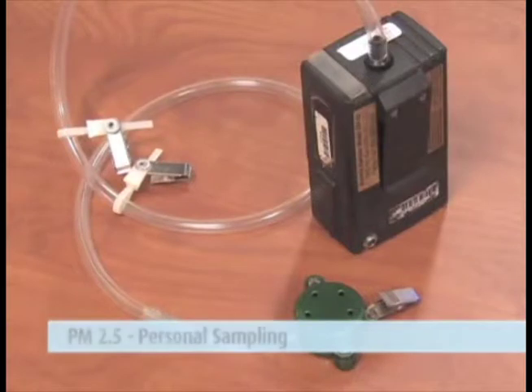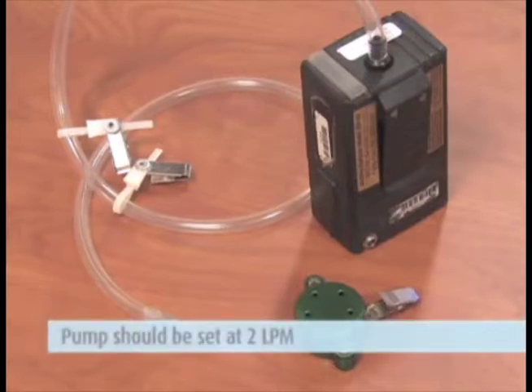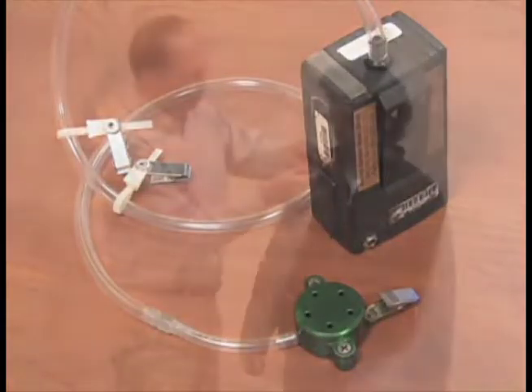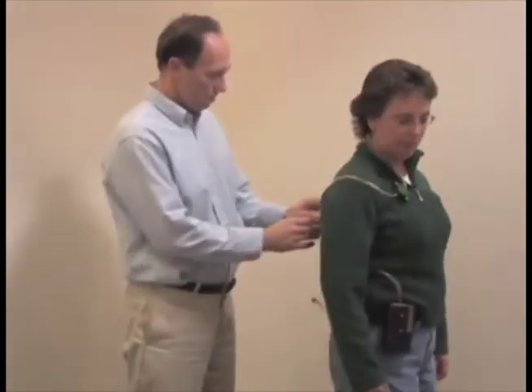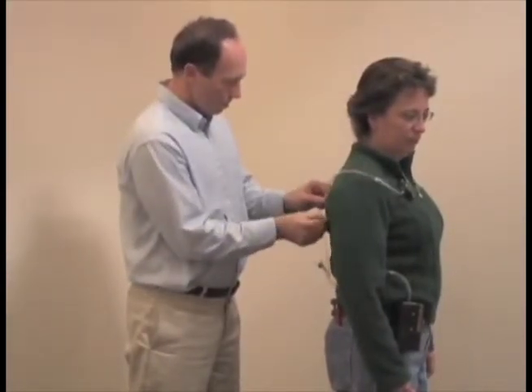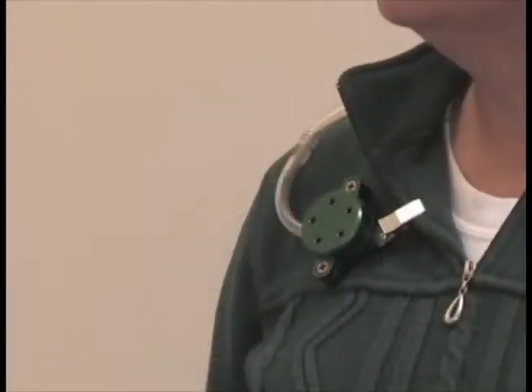If performing PM2.5 or personal sampling, attach the pump to the worker. Your pump should be set for 2 liters per minute and you should be using a green-colored PEM marked 2.0 LPM. Attach the pump to the worker's belt or pocket either in back or on the side. Bring the tubing up and around their back. Use the tubing clip to attach the tubing in place along their shirt so it is not swaying away from their body. Clip the PEM sampler onto the worker's clothing in the breathing zone.